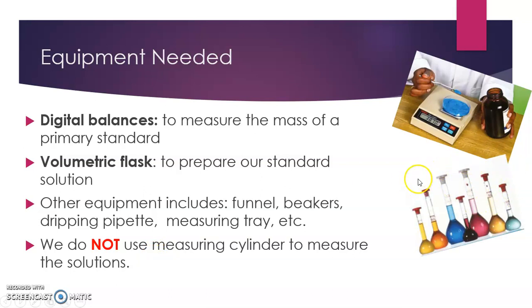Okay? These are the volumetric flasks that we're talking about. Each flask can only basically hold a set volume of solution. So therefore you have different sizes.